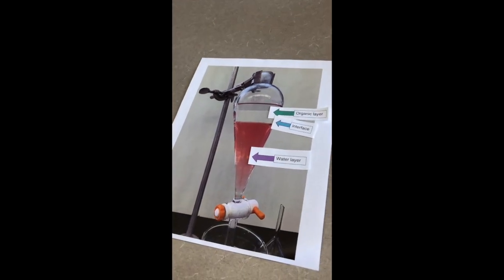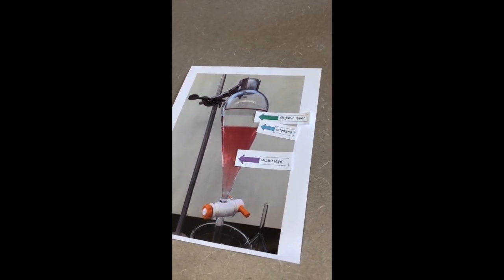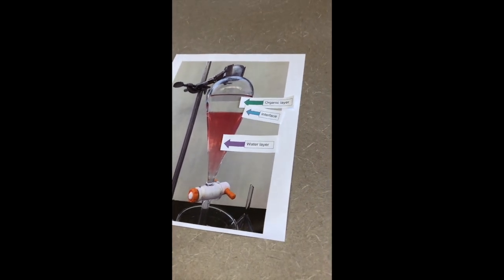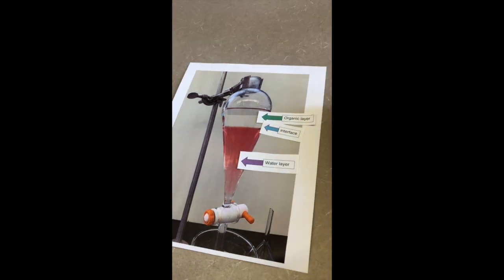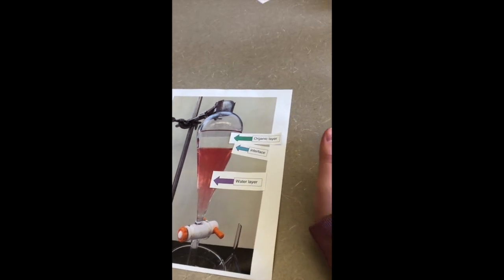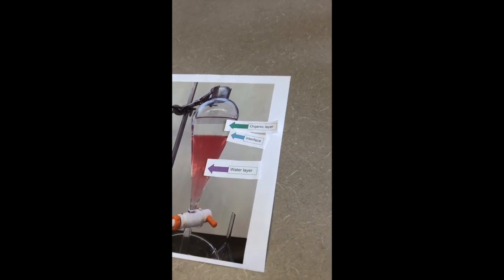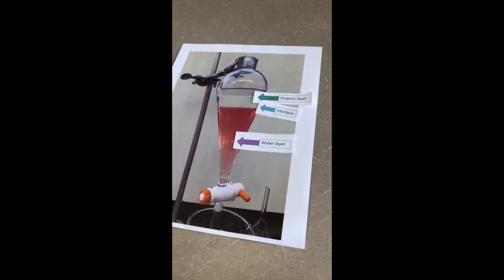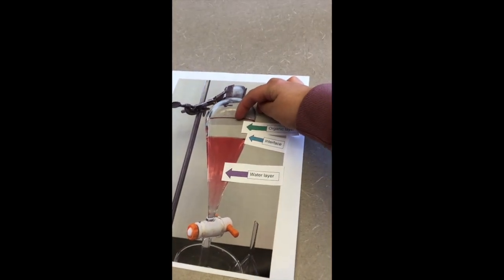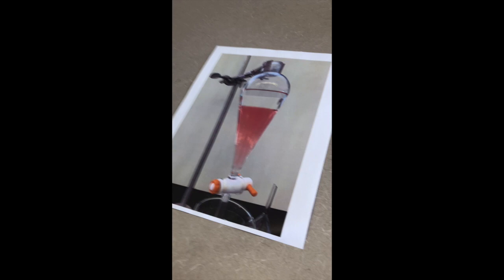So we poured our mixture of our 3 compounds and our diethyl ether into the separatory funnel, and we added some sodium hydroxide and we inverted it. And now we have our couple of layers. So since we added our sodium hydroxide, our acid is going to be in the water layer because we took off that hydrogen, which gives the acid a charge, and now it will stay and mix with the water, whereas before it was in the organic layer. So this is going to be where the salicylic acid is, and the camphor and quinuclidine is in the top layer.